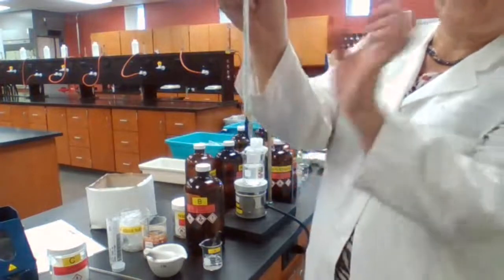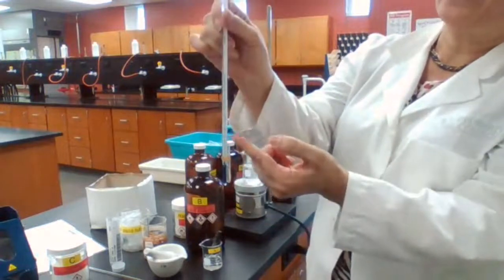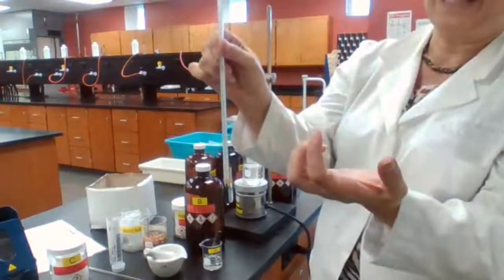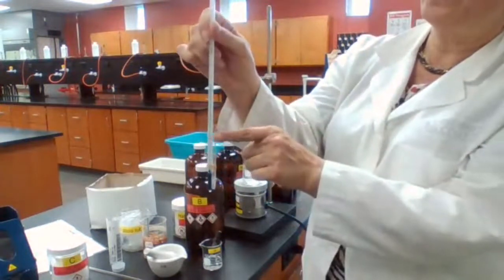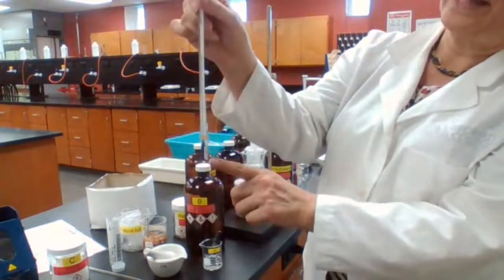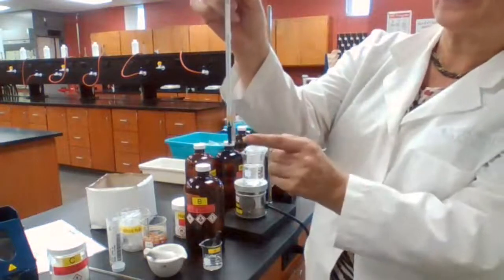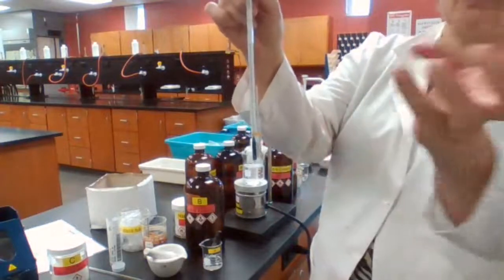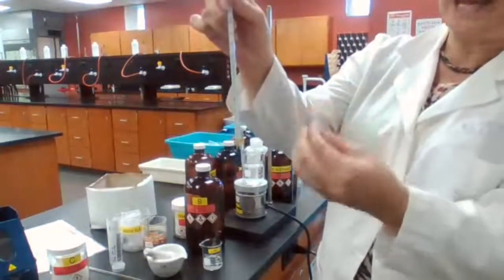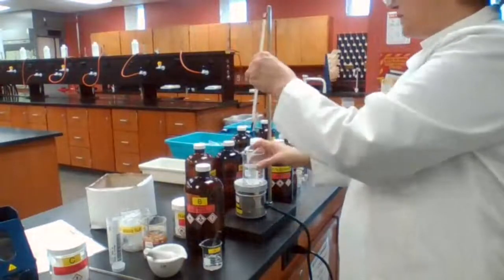So at the temperature that this sample starts boiling, it changes to gas, and the gas in an open container is hard to see. But for the capillary tube, the open end is all the way down here. The bubbles are going to come out, and when they come out, they're easy to see inside the liquid. And I'm going to bring the camera close so you can see it, and you could also take a screenshot of the setup for the boiling point.